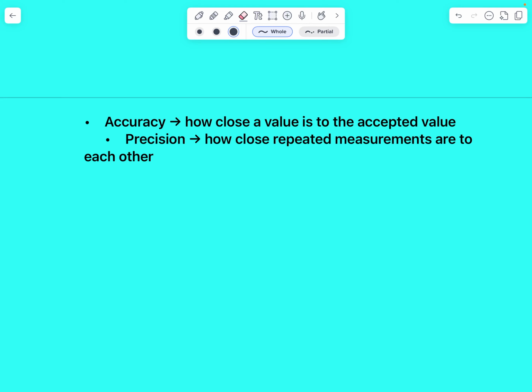Today we're going to work on our general chemistry lab 2, focusing on accuracy, precision, and percent errors, and I'll explain why each answer makes sense. Lab 2 is about understanding how good your data is, not just getting a number. You're learning how to judge results like a scientist.